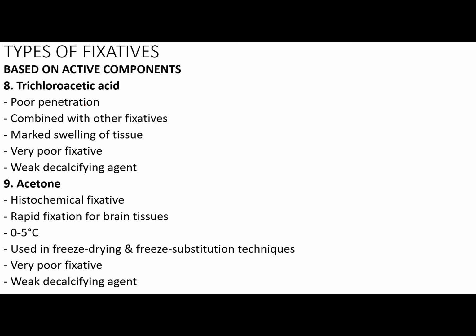Then we have your trichloroacetic acid, which would cause poor penetration, can be combined with other fixative, marked swelling of tissue. It is a very poor fixative, weak decalcifying agent. Then we have your acetone. This is a histochemical fixative, rapid fixation for brain tissue. You have to set it at a temperature of 0 to 5 degrees centigrade. Thus, it is very ideal for freeze drying and freeze substitution technique. Very poor fixative as well and a weak decalcifying agent.